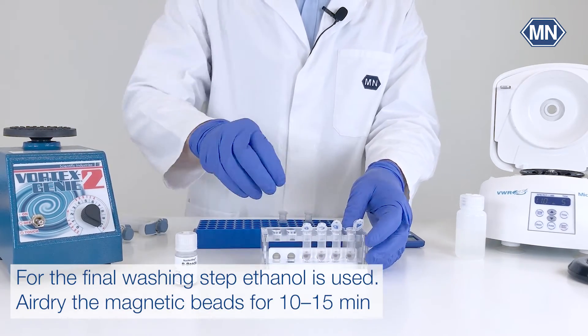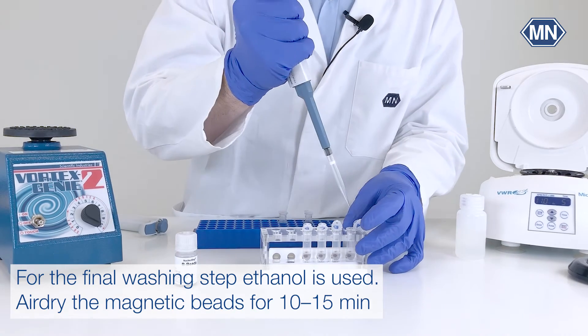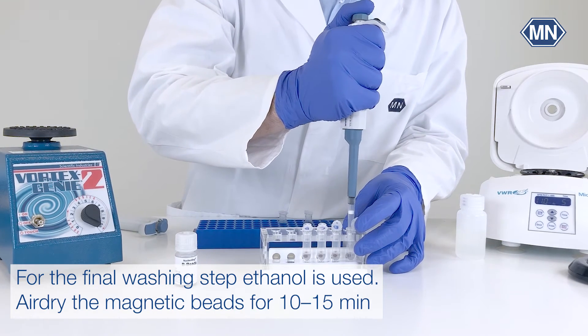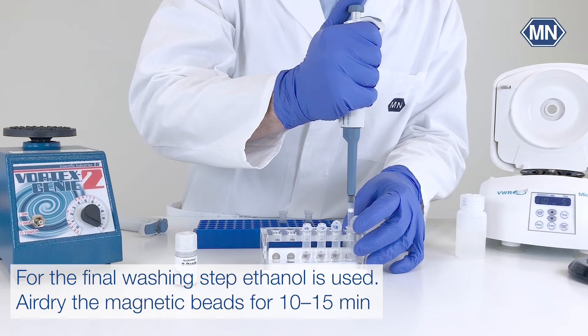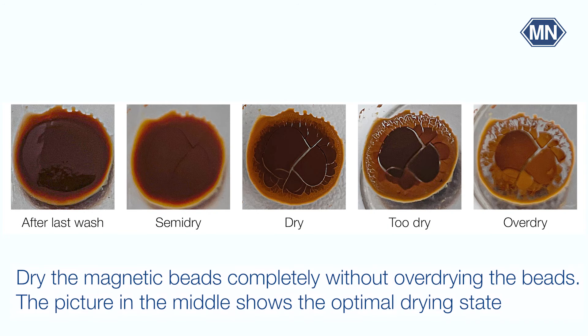For the final washing step, 70% ethanol is used. After removing the supernatant, air dry the magnetic beads for 10–15 minutes. It is very important to assure that the ethanol has evaporated completely without over drying the beads.